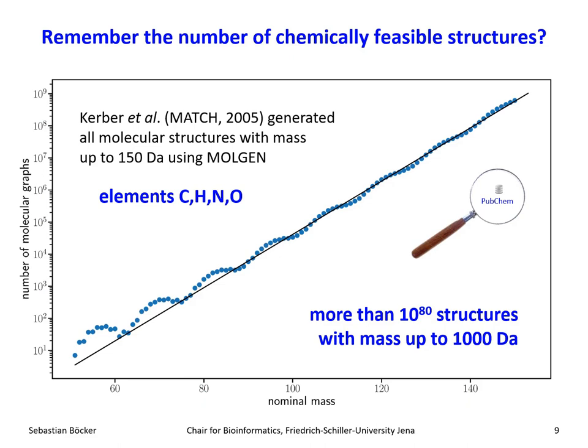It's so big that every number that you get into contact with on a regular scale is unbelievably tiny. And I try to show that here when I showed that PubChem in comparison is not small. PubChem, you wouldn't even see that here. It would be less than 1 pixel if I would draw that in a correct scale. PubChem has 100 million structures, so that's 10 to the 8. And 10 to the 8 compared to 10 to the 80, that's a 10 to the 72 difference. And it doesn't even matter if you filter those structures by some very, very strict rules, which say, let's pass only one compound structure every quadrillion, or I don't know. It will still be 10 to the 60 structures. It's still unbelievably much more than the structures in PubChem. So this is what we have to keep in mind, and we have no clue how many of those structures are actually present in any sample out there.